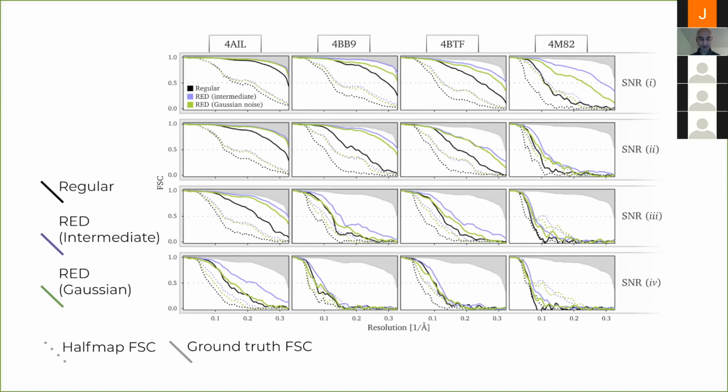No, actually, I'm not exactly familiar with the different approaches in crystallography, but I can generally comment. One of the problems in crystallography is that you're doing things in Fourier space, and it's quite difficult.